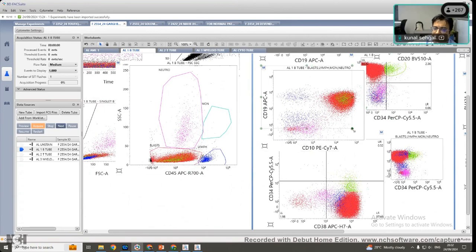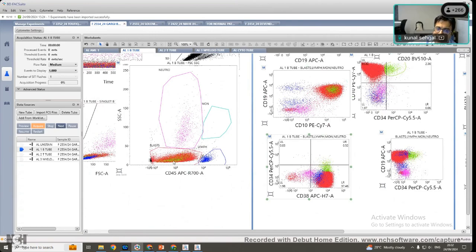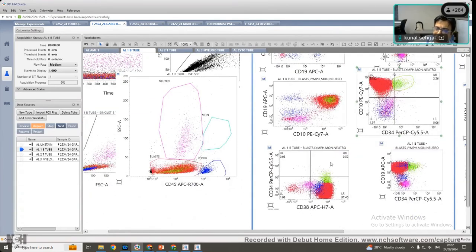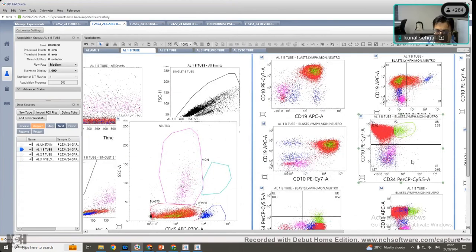What is the diagnosis? These are blasts which are CD45 dim to negative, which are expressing markers CD19, a bright CD10, and they are CD34 practically negative, CD20 practically negative. Any diagnosis? You are seeing sheets of blast on the marrow, on the blood, sorry. What would be your diagnosis? Is it a leukemia? More than 85% blast. Yes.